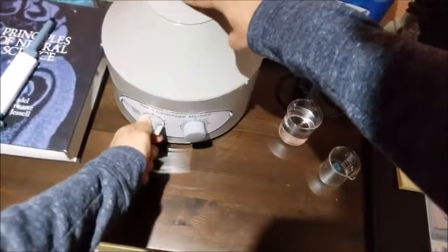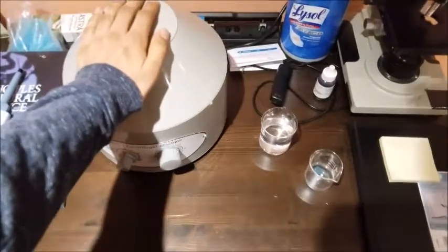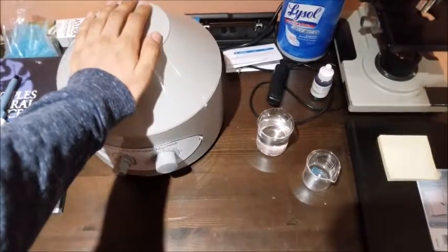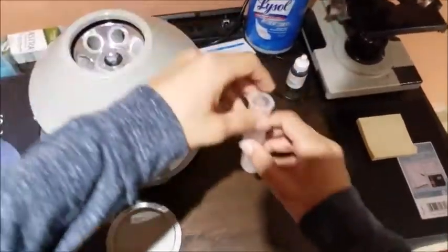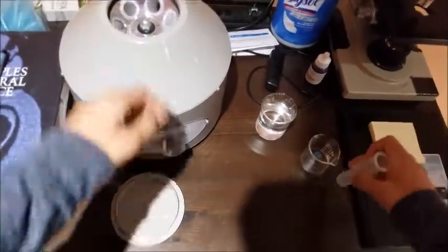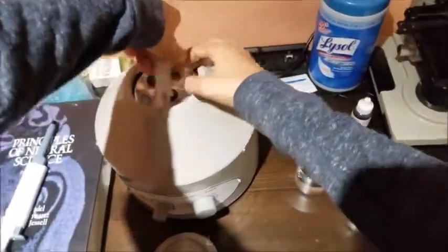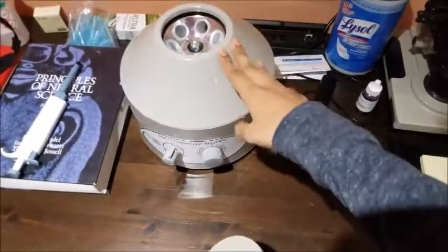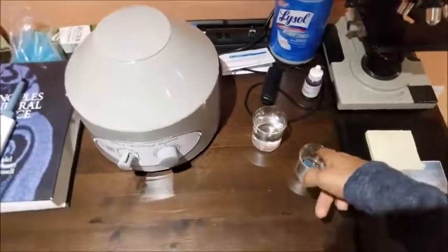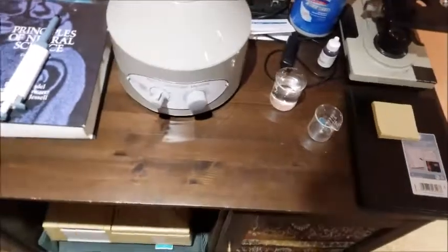Once you're done centrifuging, turn the RPM dial back to zero and wait until the rotor stops turning — wait until the noise stops coming out of the machine. Then you can open the lid, take your tubes out, and decant your supernatant. Now your tubes only have the pellet or the solid phase left in them, and you can use that for whatever purposes you want, or use the supernatant if that's the desired product. That's it for this video, thank you all for listening.